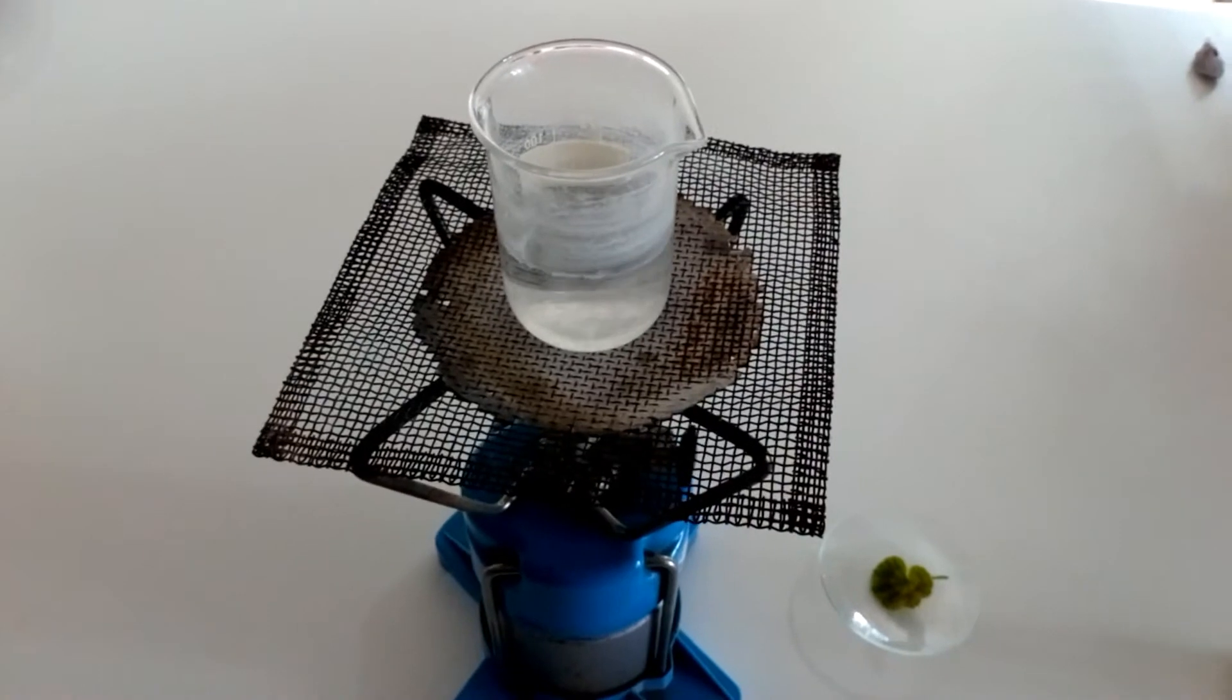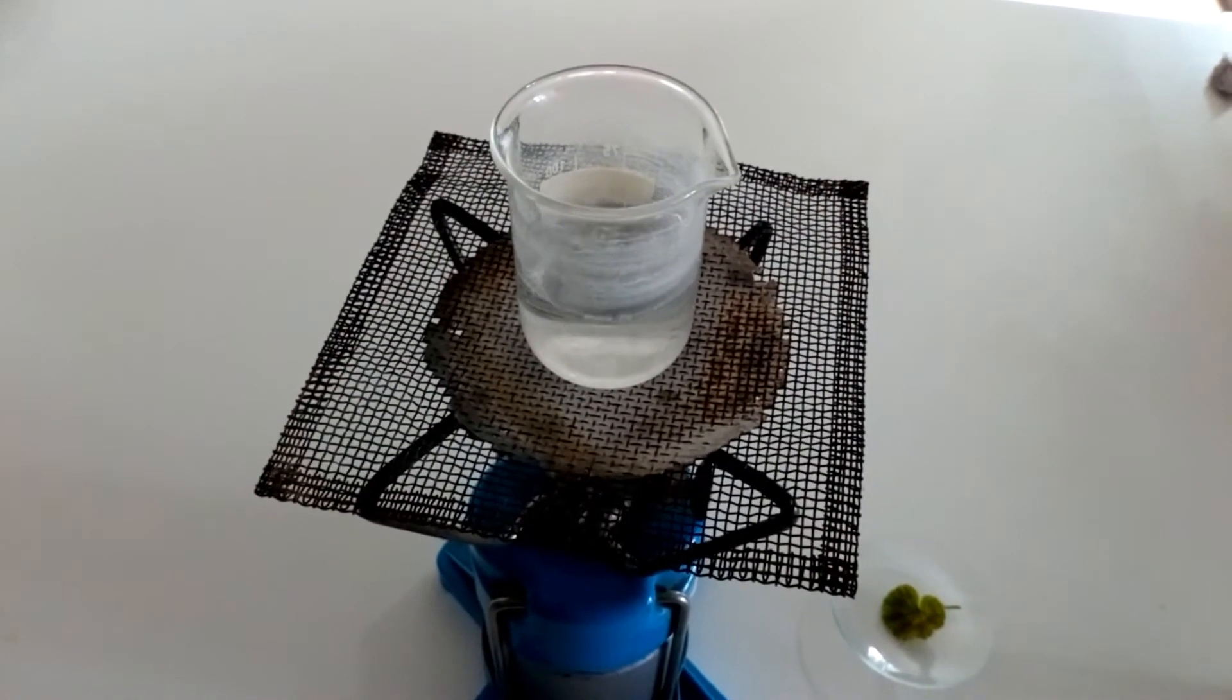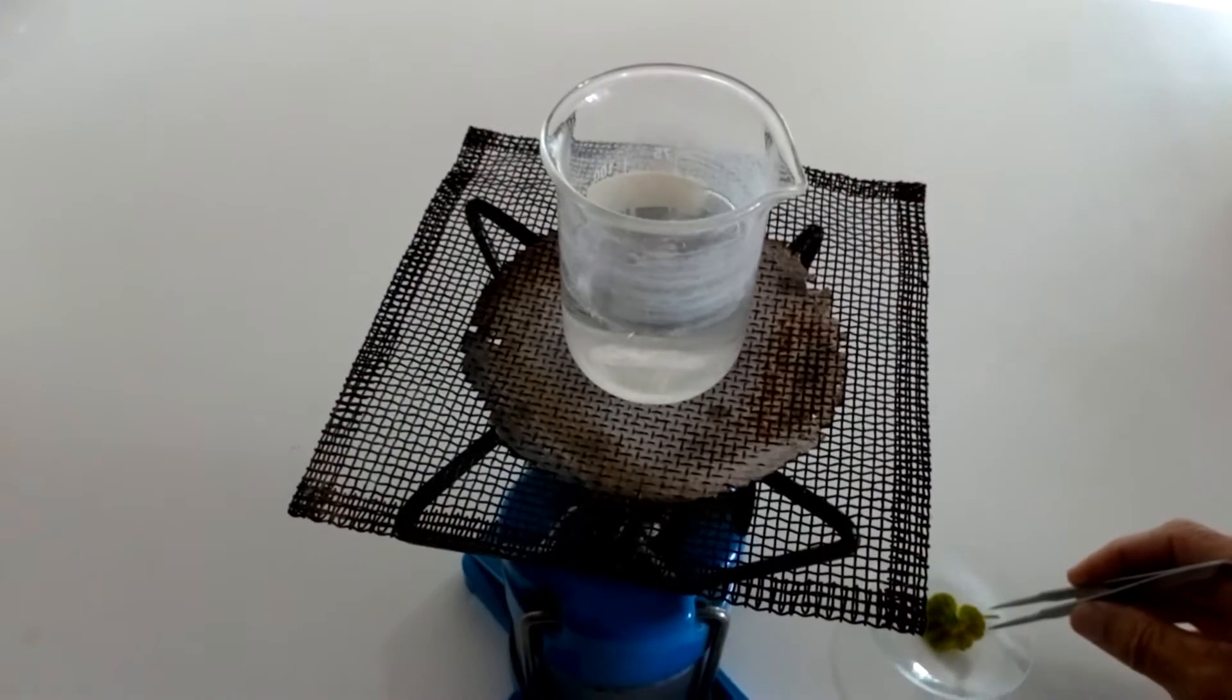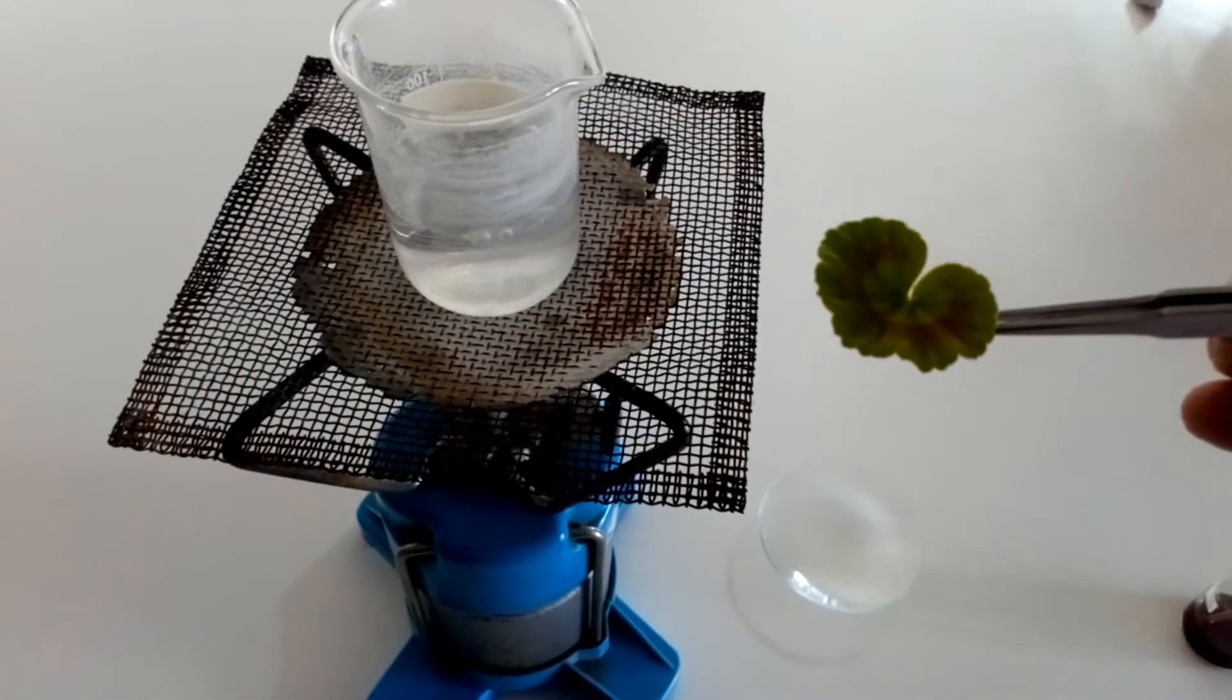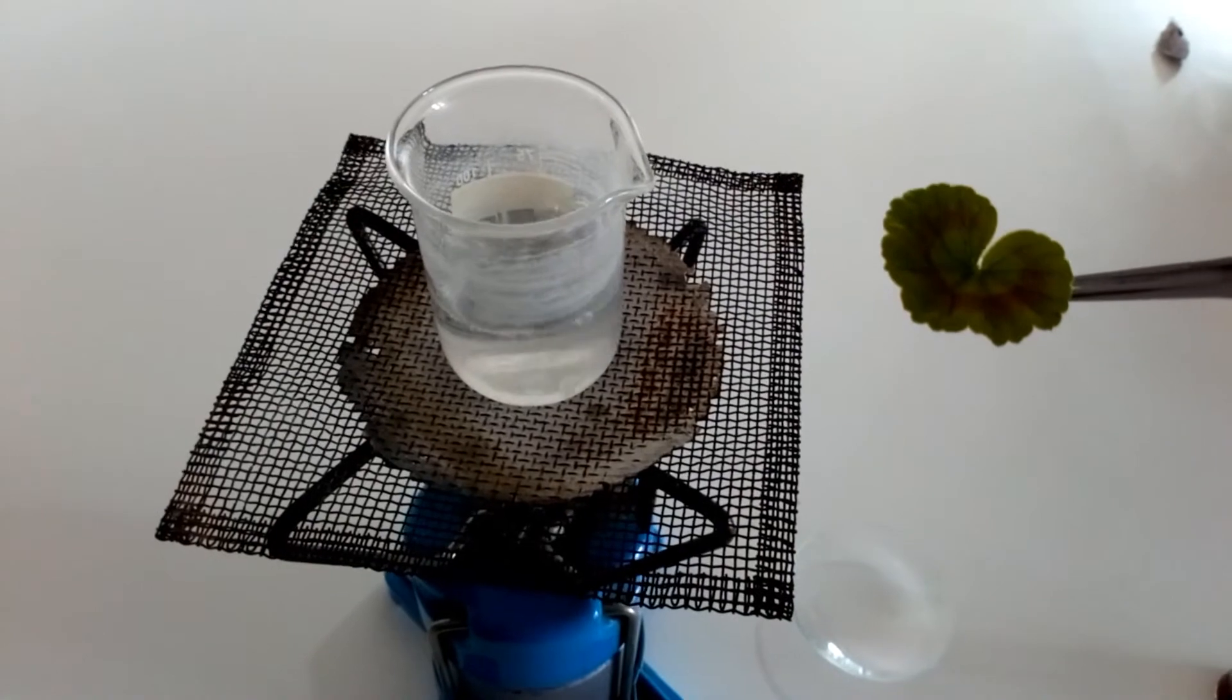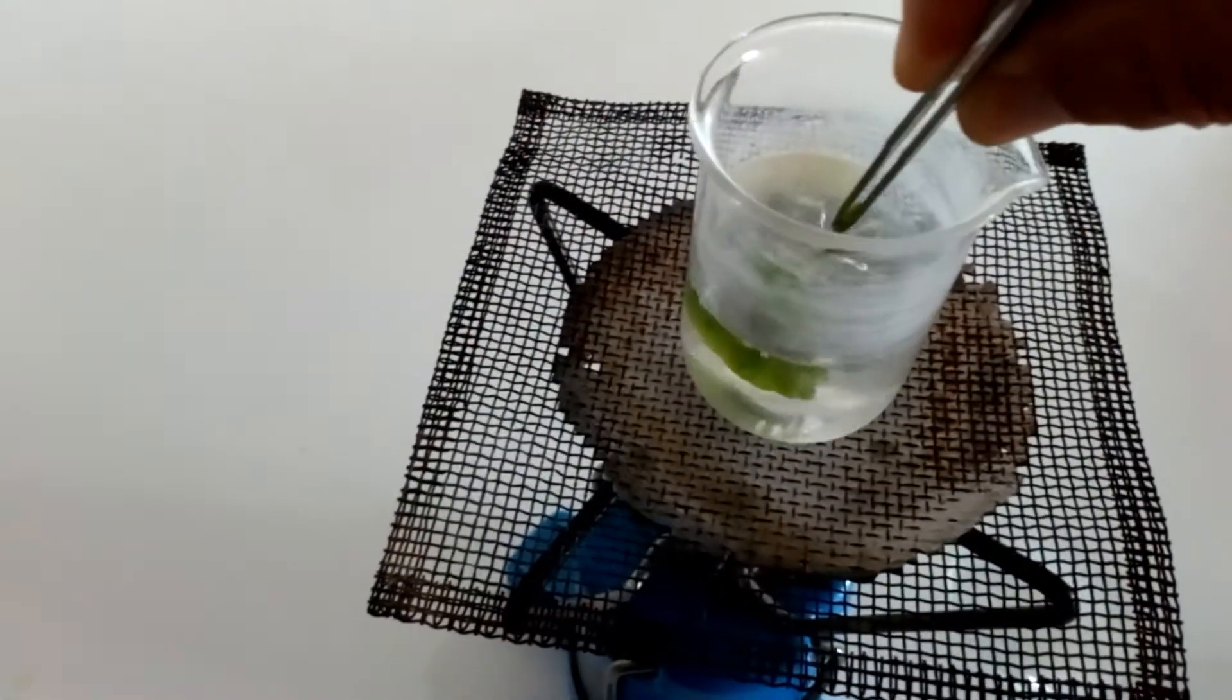So our first stage is to make the leaves so that the cell wall begins to break down, and we also stop all the things happening inside the leaf. Things happening inside the leaf, the chemical reactions, that's called metabolism. And in order to stop all the metabolism working, we're going to put the leaf into some boiling water.